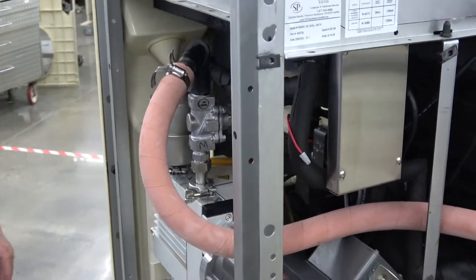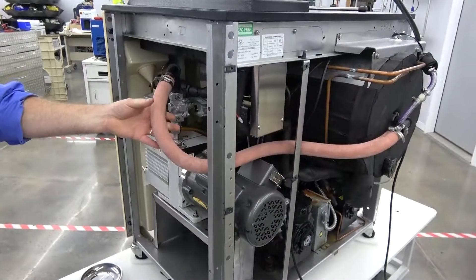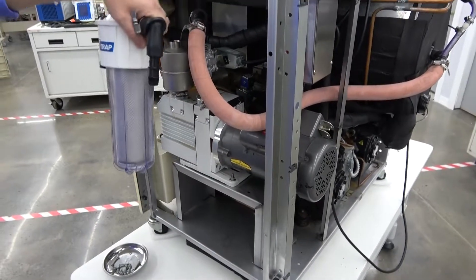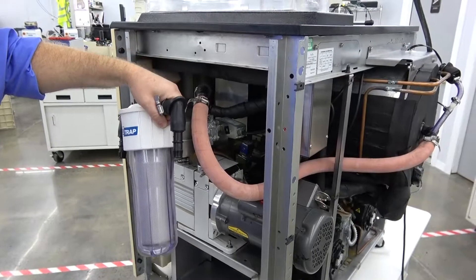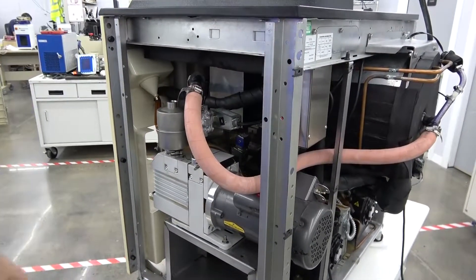With this side panel off, we temporarily just hooked our vacuum line up directly to the pump. Normally, once we get it back together, you'll have the filter trap out here, and then the lines will connect to it, too, to help trap some of the contaminants before they get to the vacuum pump.